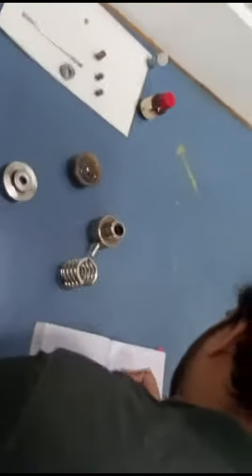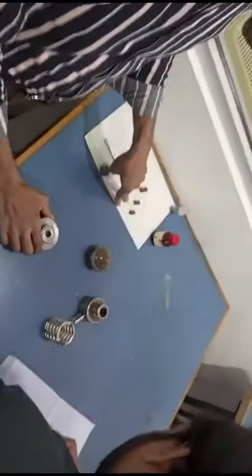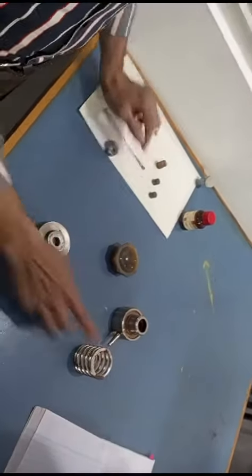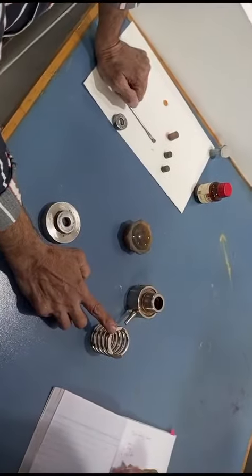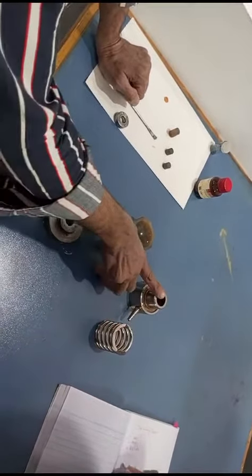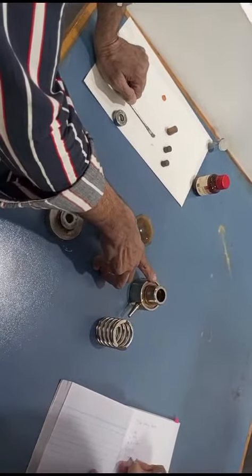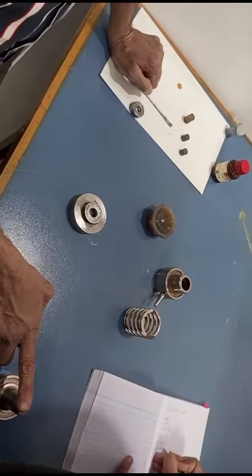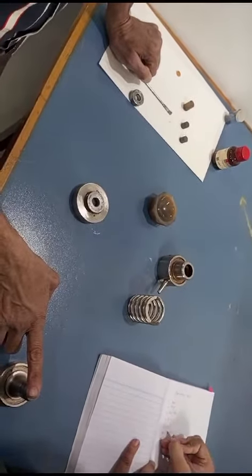Number 20, number 21, number 22. This is a spring, this is a bearing, and this is a plunger — P-L-U-N-G-E-R, plunger.